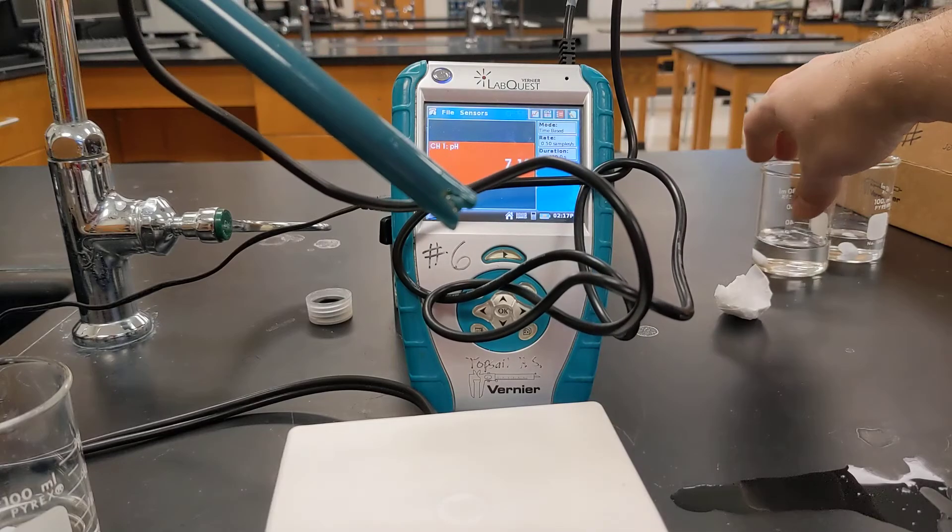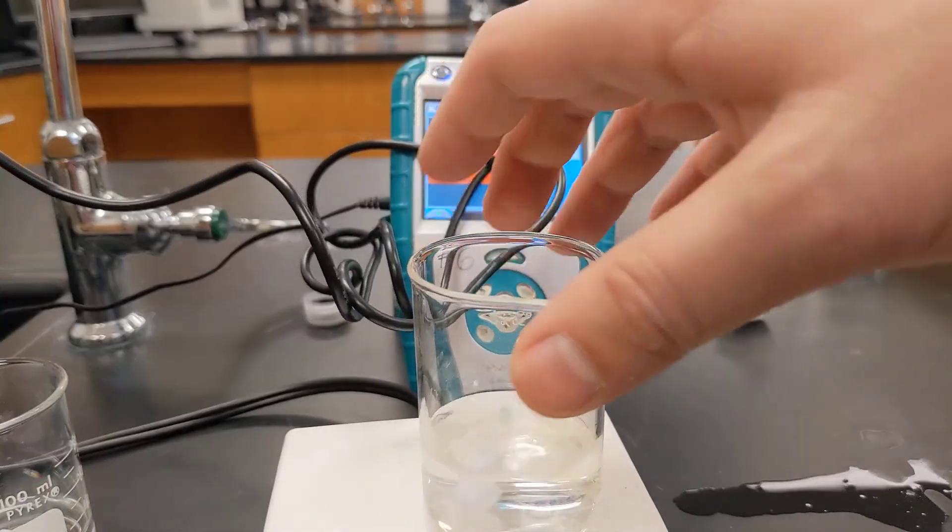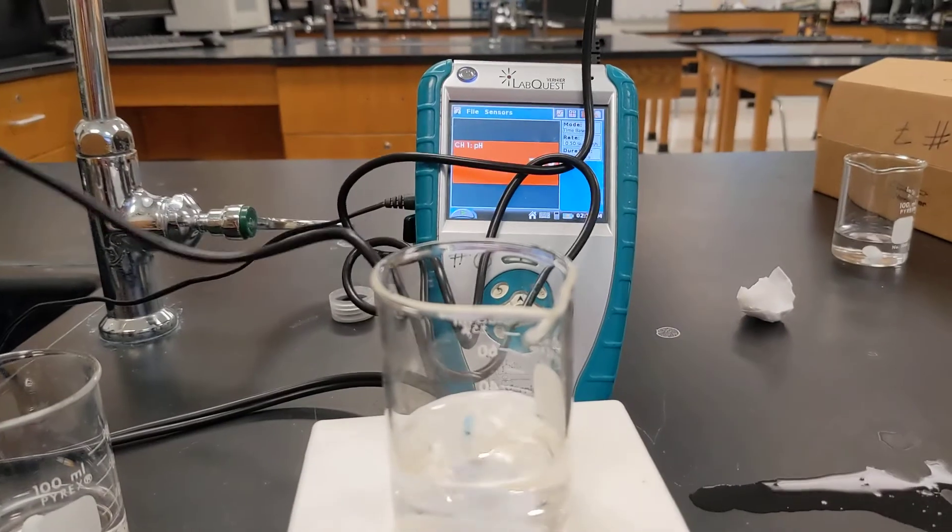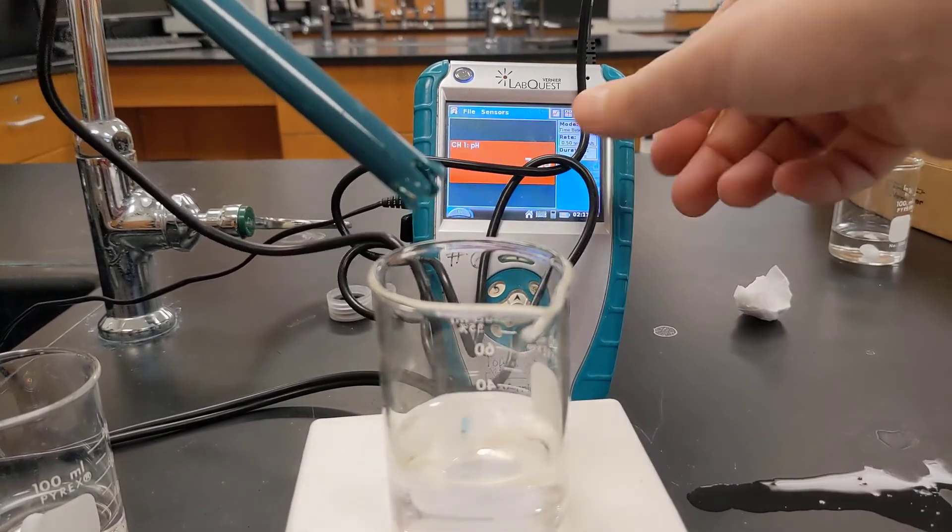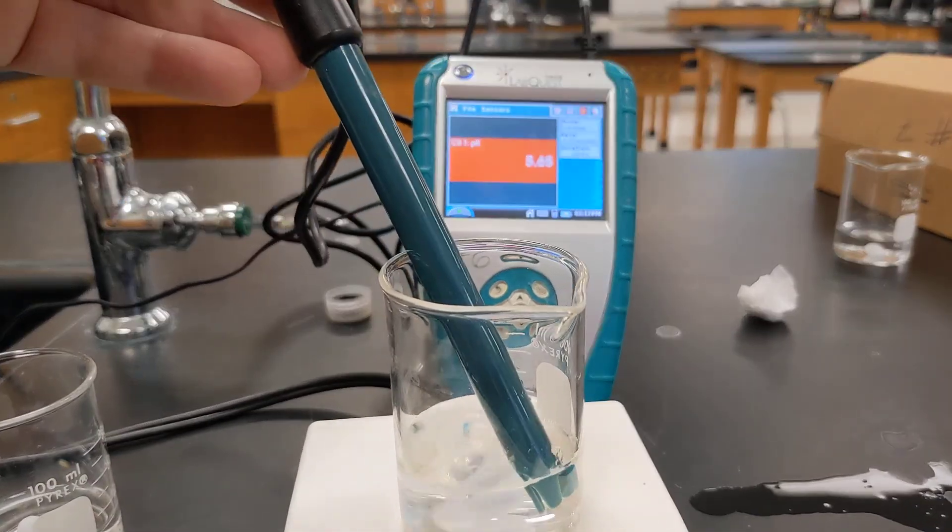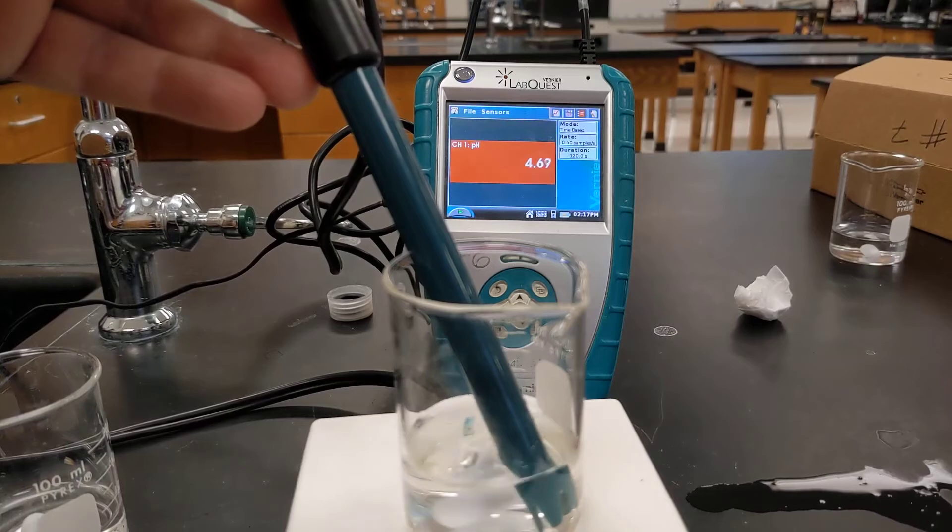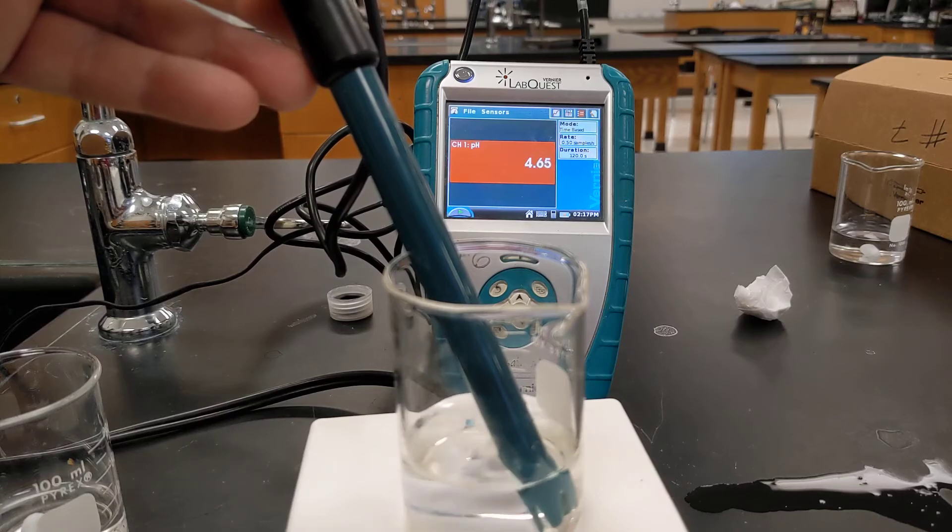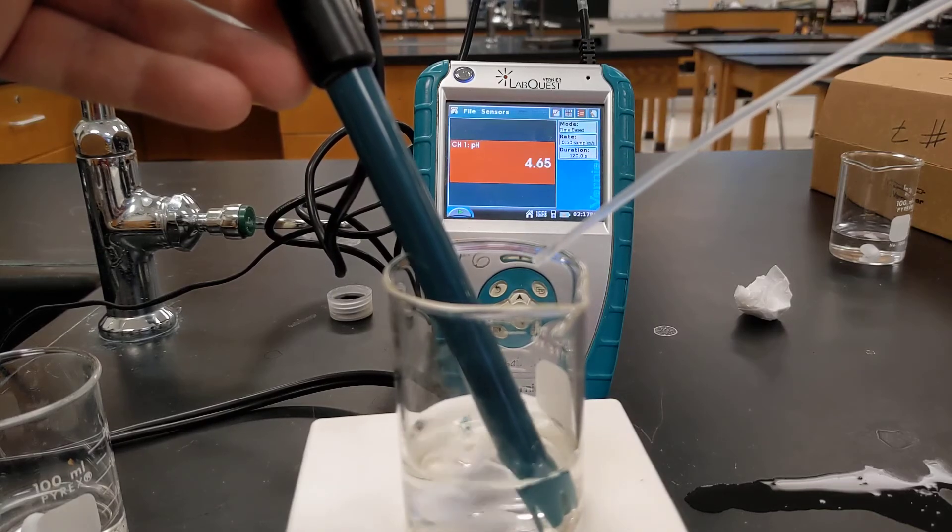I have yet another buffer solution I can show you that I've made using acetic acid and sodium acetate. We'll see what happens with it. See if I can keep everything in view for you. So with this one, this one has a pH of around four point six five. So let's see what happens if I add some hydrochloric acid.